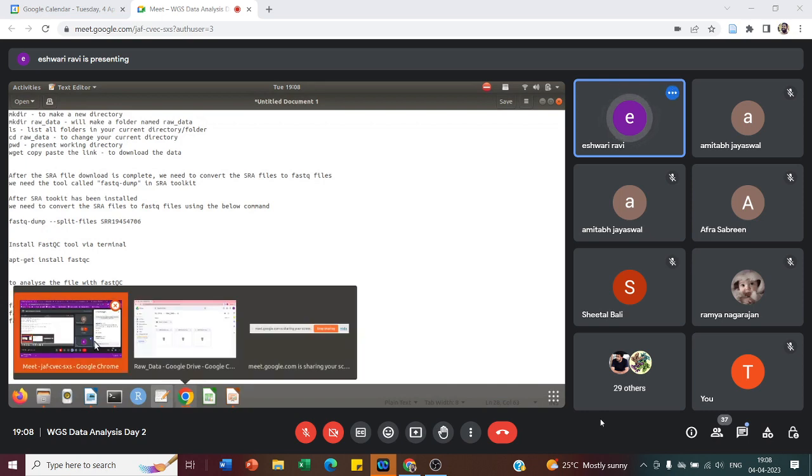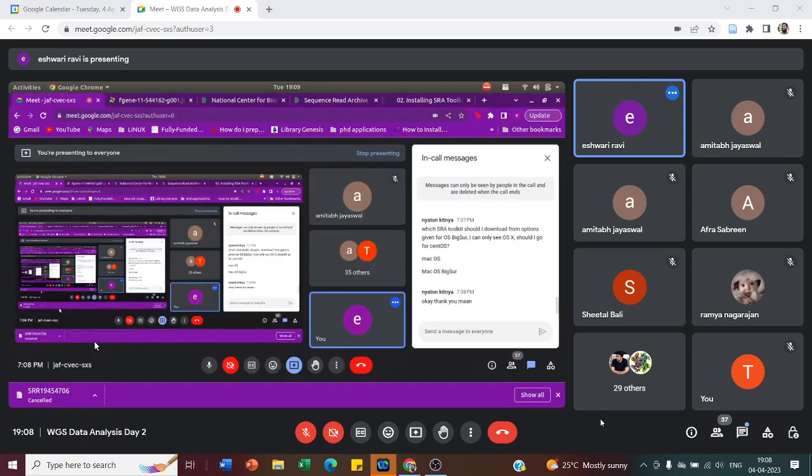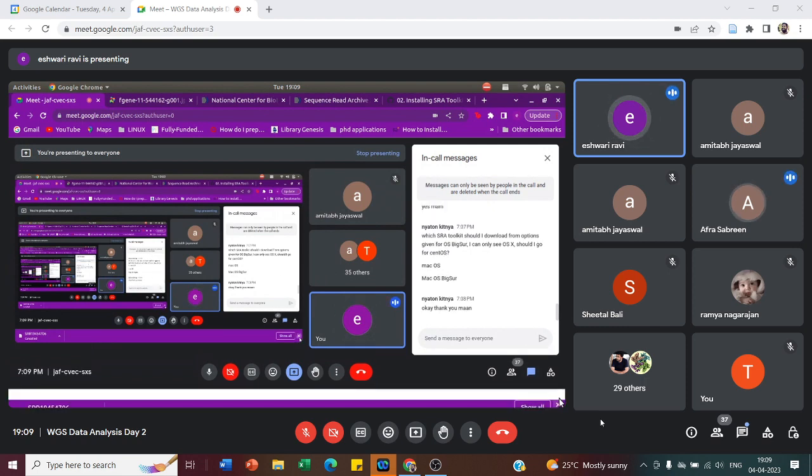Please let me know. I shall be sharing all the commands and installations of the tools specifically for tomorrow's analysis anyway. But shall I proceed further or shall I wait? You can always message and let me know right now in the message chat box.